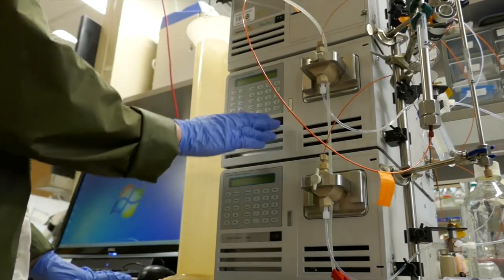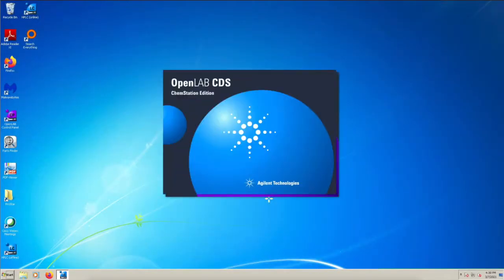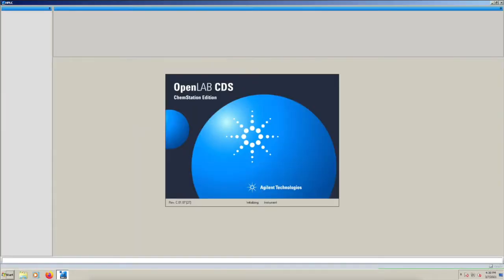Once that's done, we're going to turn on all the pumps from the bottom up and then launch the program on the computer.